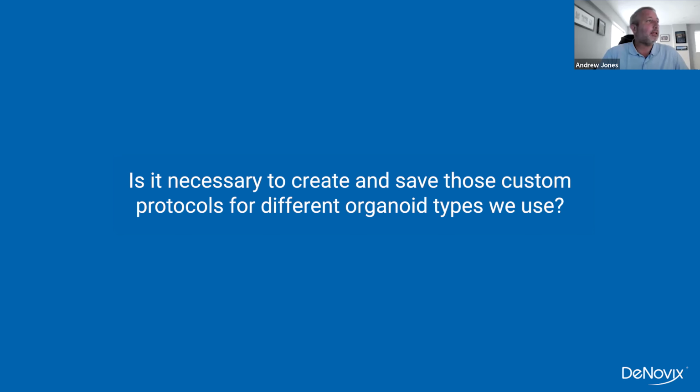And is it necessary to create and save custom protocols for different organoid types that we use? Nope. You can just use the default protocol and you can do that each time. Not required.